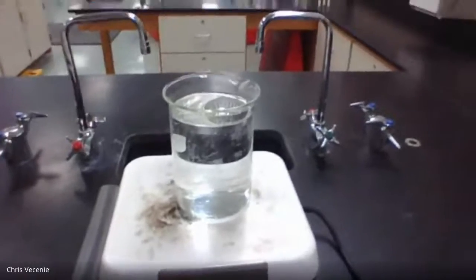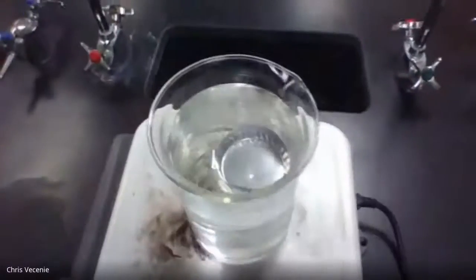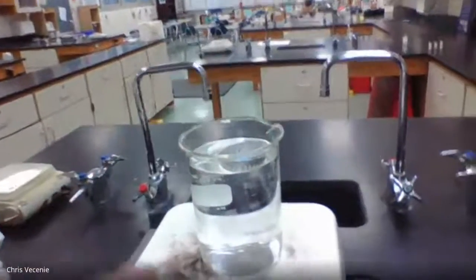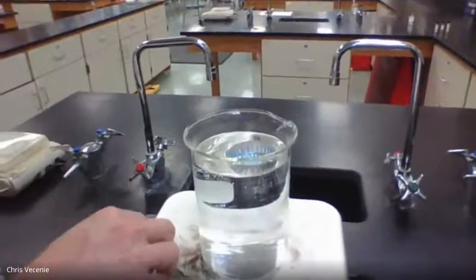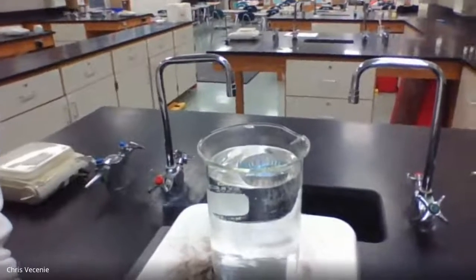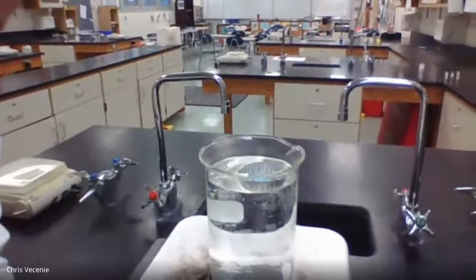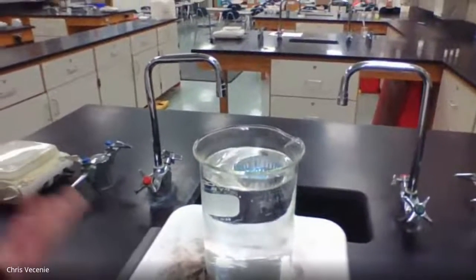So if we showed you the first test, here's what your setup looks like if we're checking its melting point. You have a beaker of water that's got a little dish in here. And what you would do is sprinkle a little bit of that solid onto the dish. And that water would be boiling usually, and we know boiling water is at 100 degrees Celsius. So if the substance melts, you know it has a melting point below 100. You would see it liquefy. If it doesn't melt, you know its melting point is above 100, right? And it stays solid.